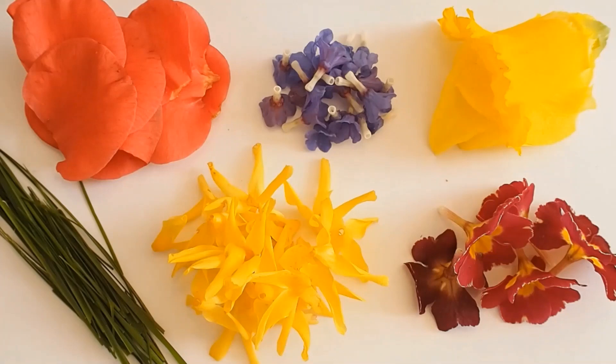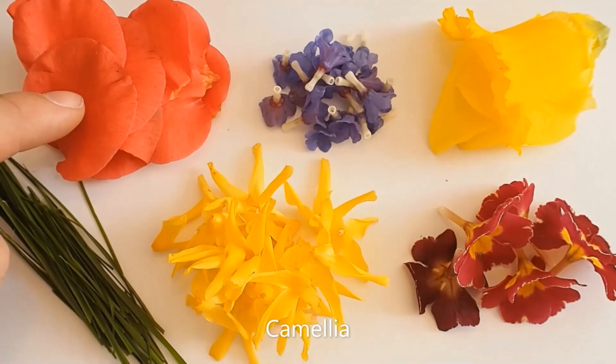The first thing we need to do is have a look at all the different flowers or parts of plants we're going to look at. So firstly here we've got some grass — just ordinary garden grass from my garden. And here we've got some petals from a camellia flower, a lovely flower.